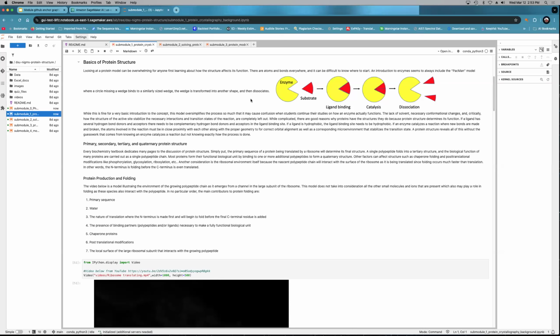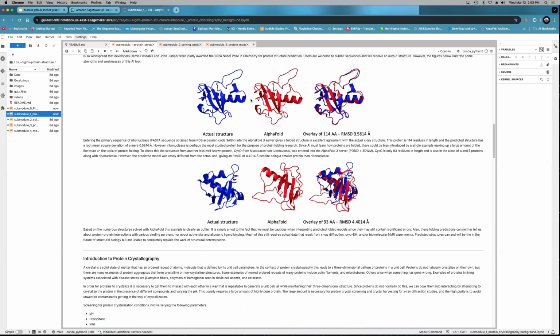And yes, of course, I get into a discussion as well of the concepts of AlphaFold. AlphaFold is very useful, but AlphaFold can't do everything. AlphaFold is not going to tell you if another protein binds to your protein that you don't know about. It's not going to tell you if a small molecule will bind to the active site. Those are separate questions. It's immensely helpful because now we can use known structures to solve structures from X-ray data.